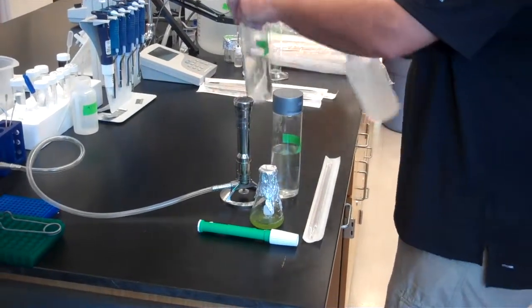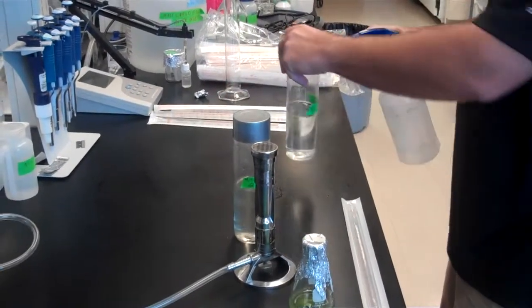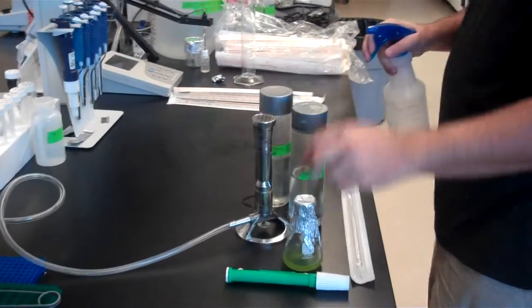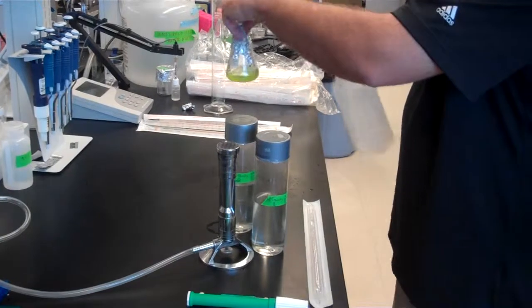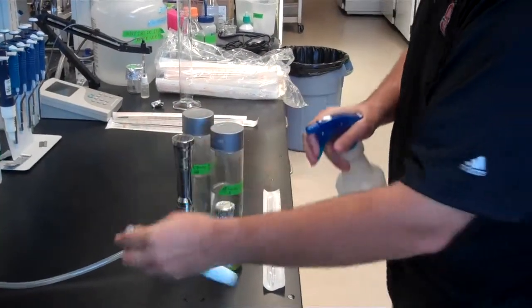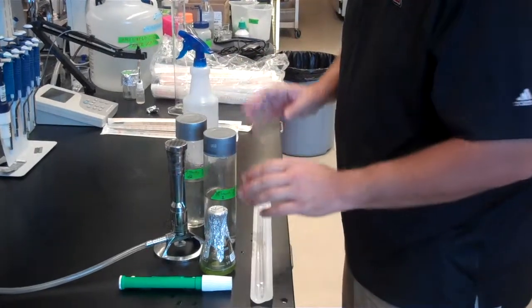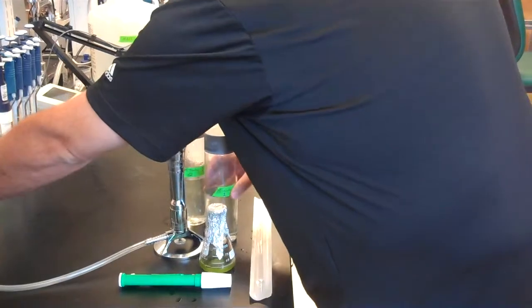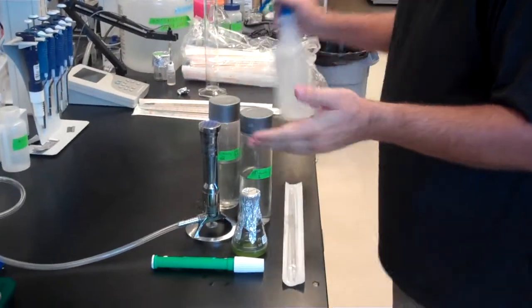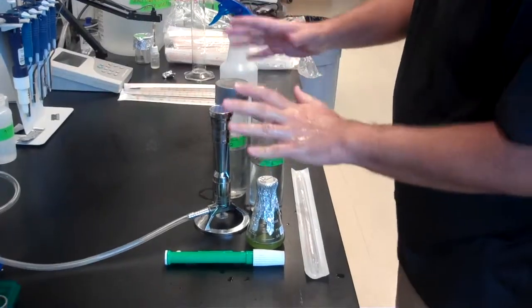So this is what we're going to do. Ethanol is extremely flammable, so do not turn on the burner before you spray this stuff down. Okay, now that everything's sterile, we can go ahead and start our gas. And from this point on, I'm going to spray my hands down. Should have done that before I did the burner. I'll do it away from it.